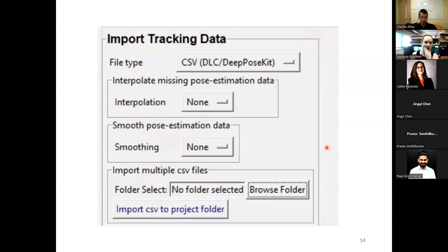All of our cameras use global rather than rolling shutters to take images. As far as I understand, that can help decrease the blur a little bit. If anyone knows more about how cameras actually work, that would be helpful. Higher FPS can also help get you more frames that are really clear.